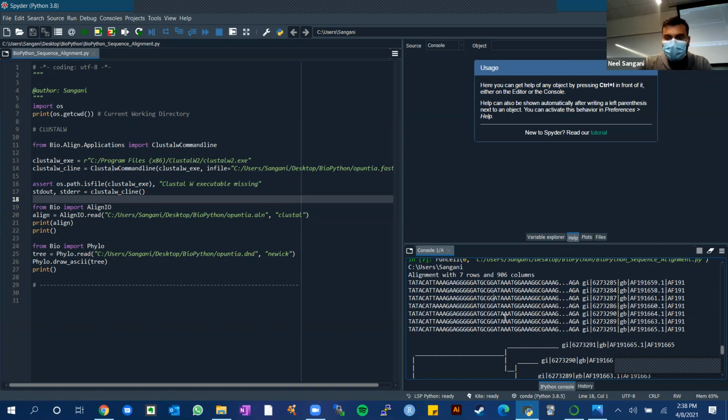So we see that there is an alignment across each, and then we can do some sort of tree, right? So align.io.read is simply reading the file, and again, notice this is an alignment file. It gives the output in the clustal format, and it's ideal for whatever alignment you do through MUSCLE or Needleman that I'll get into next. It's a good habit to have it in clustal format because it's universal and readable. It's easy to look at, I guess.